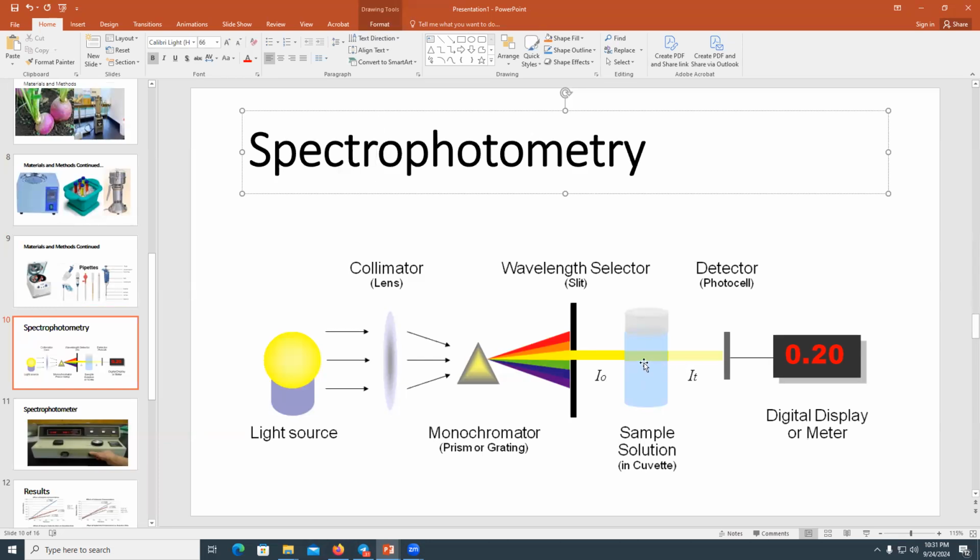So our hypothesis must be the darker the solution is, the more amber the Guaiacol is, that means the more product, the more oxygen was produced. That means the more active the peroxidase is. And then we will have different test tubes with different independent variables, like different pH ranges, different temperature ranges. And we will also have a control solution.